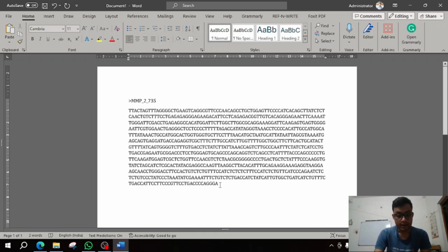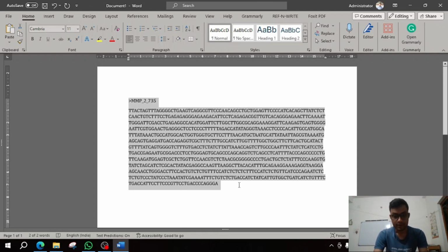Now this total sequence, from top to bottom, is known as the FASTA sequence. You have to search and identify your single nucleotide polymorphism in it. After that you can proceed, that means decide from which length you can obtain your primers to get the perfect result for your gene of interest.